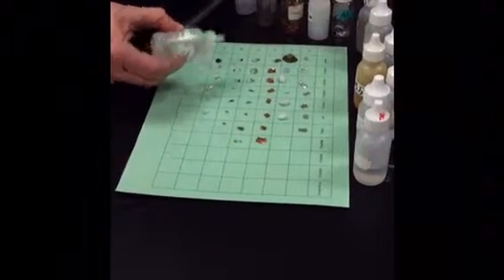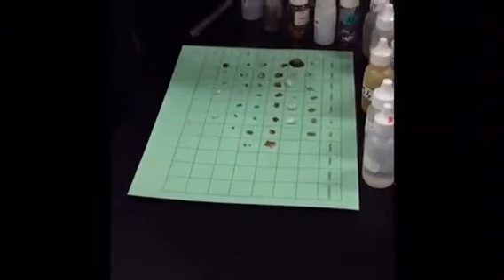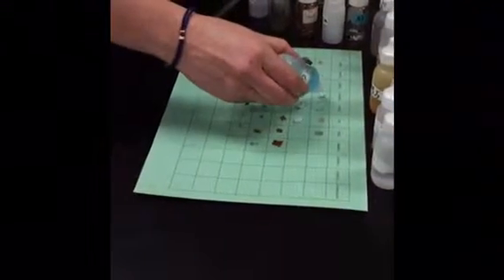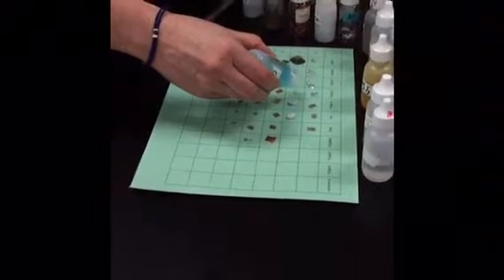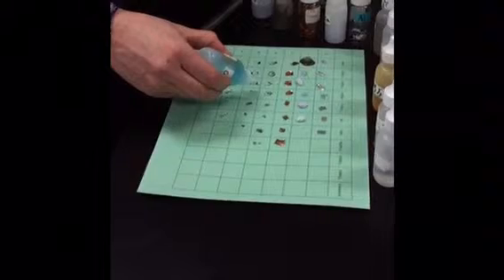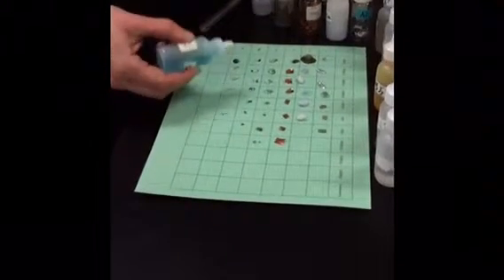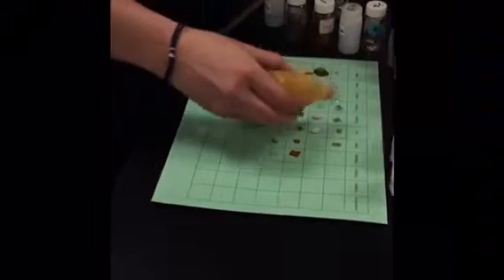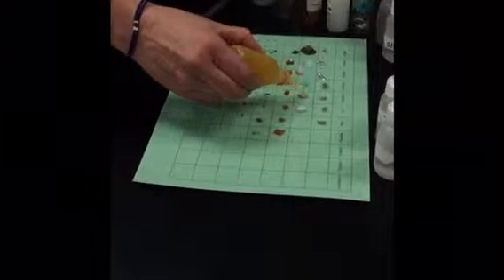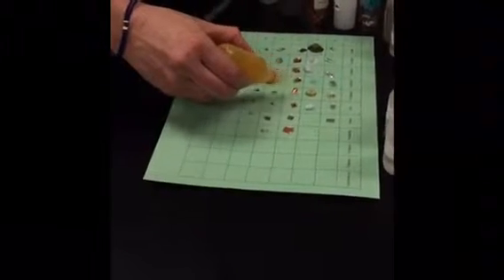On your data table, you're going to record your observations. If you saw a color change, record the color change. If you saw a precipitate, if you saw bubbles, whatever you saw, that's what you're going to record. If you saw no change, even after you'd been all the way through, gone back to check again, then you can write NR in your box.